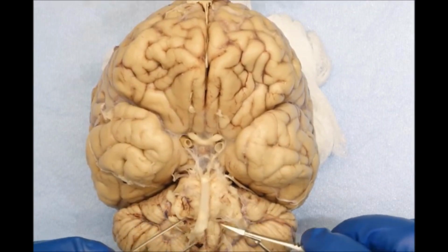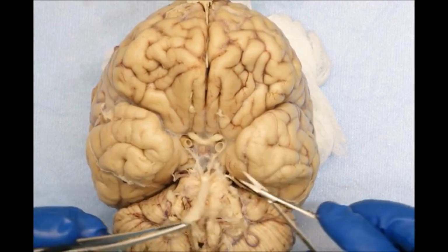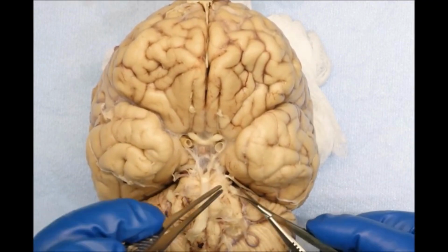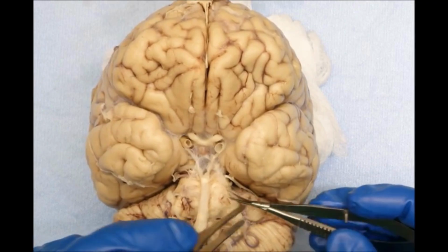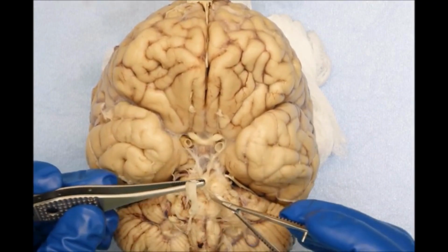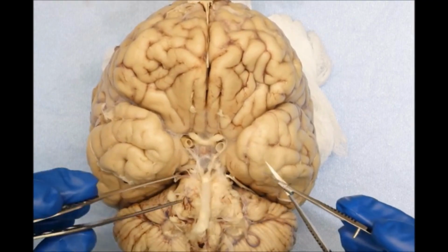This is the complete dissection of the circle of Willis. I first began removing the leptomeninges, which is a combination of two membranes, the pia and the arachnoid membranes. The leptomeninges has the consistency of a cobweb, and it surfaces the circle of Willis in this area.